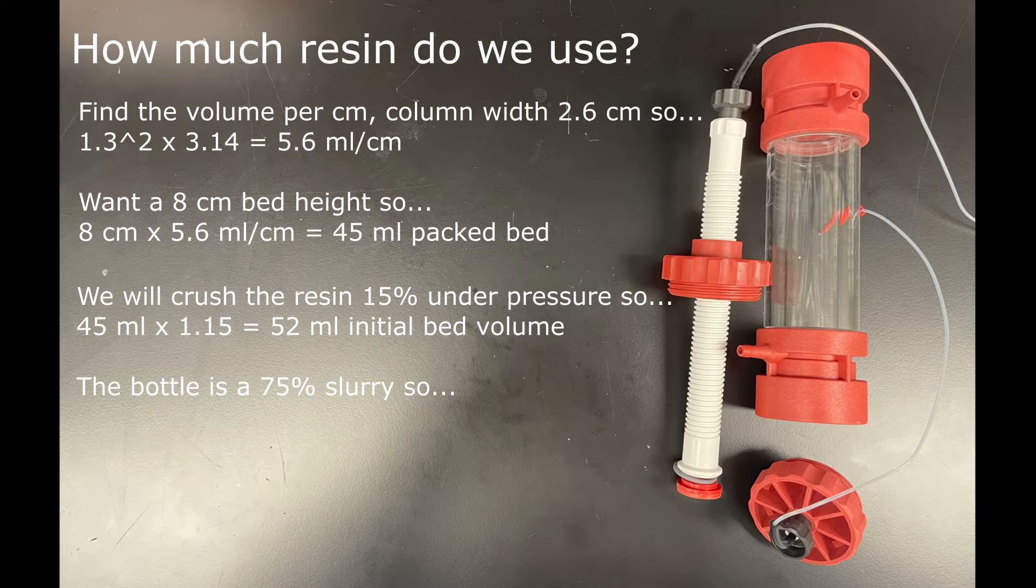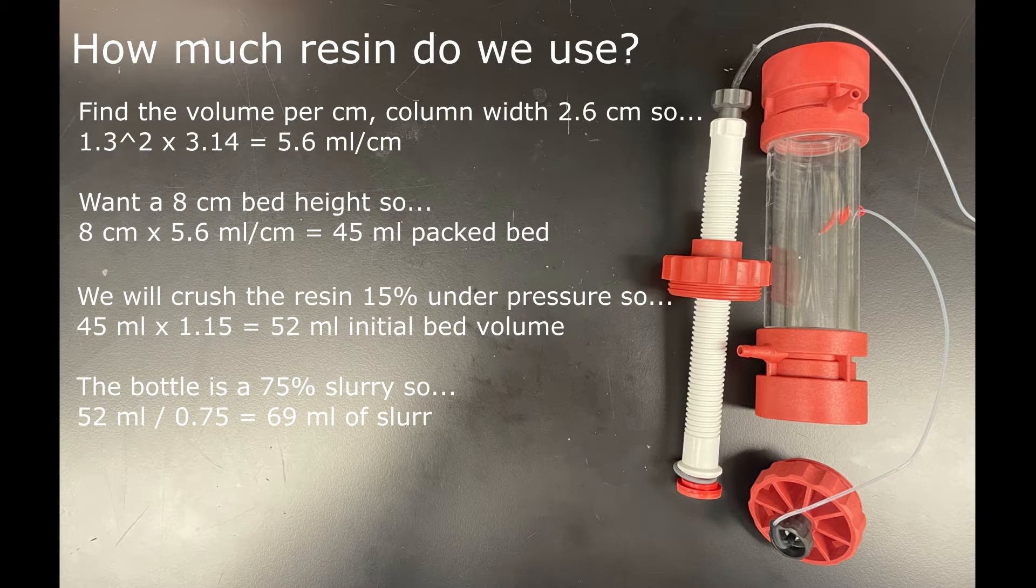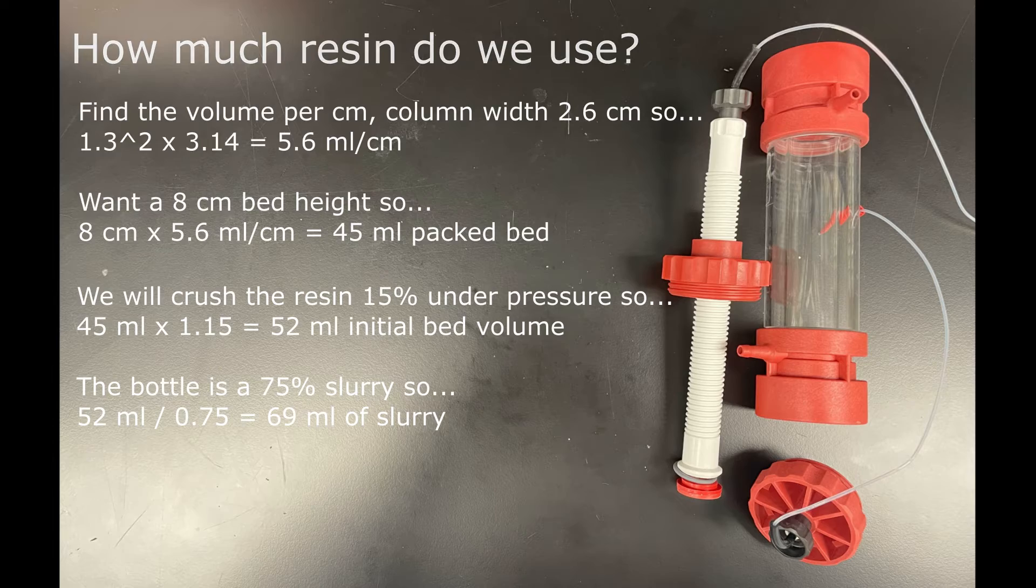Finally, we measured a slurry content of 75%, so we're going to divide 52 mils by 0.75 to get 69 mils of slurry that we need to measure out.